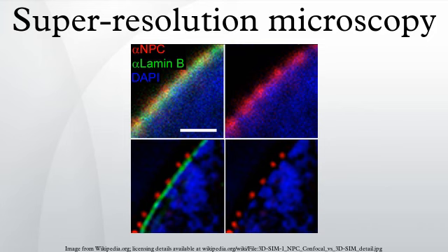Stochastic super-resolution: the chemical complexity of many molecular light sources gives them a complex temporal behavior, which can be used to make several close-by fluorophores emit light at separate times and thereby become resolvable in time. These methods include SOFI and all single-molecule localization methods such as SPDM, SPDM-PHYMOD, PALM, FPALM, STORM and dSTORM.